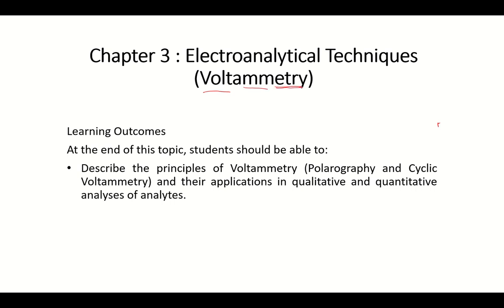Today I'm going to talk about voltammetry. Voltammetry is the measurement of I, the ampere, versus volt. At the end of this topic, you should be able to describe the principle of voltammetry. Two types of voltammetry will be discussed: one is polarography, another is cyclic voltammetry, and their application in qualitative and quantitative analysis of analytes.